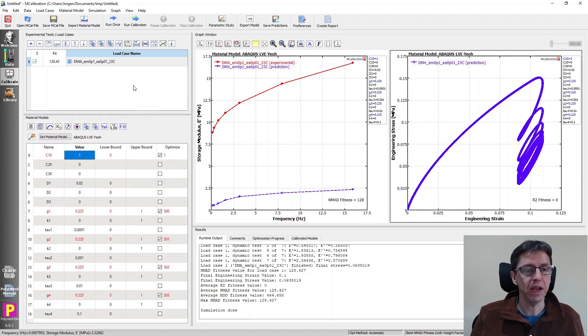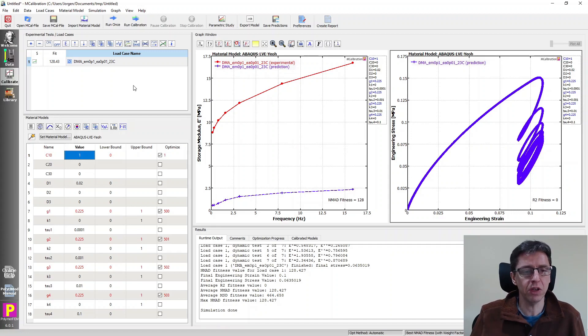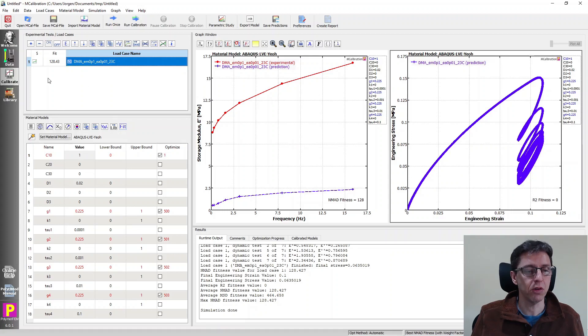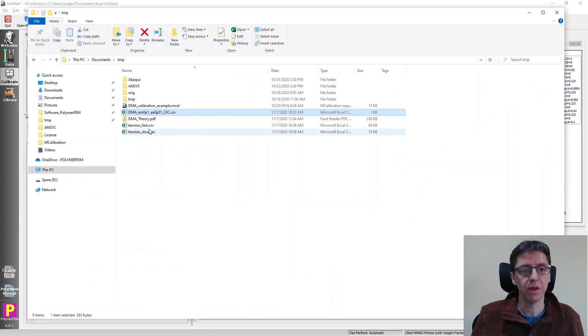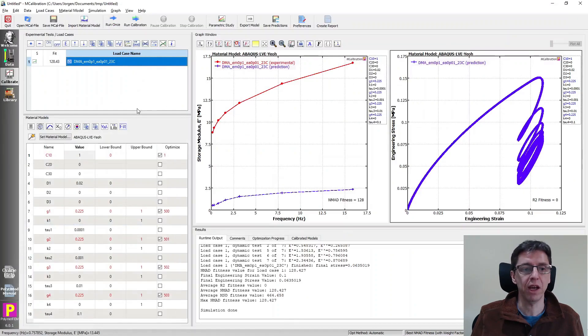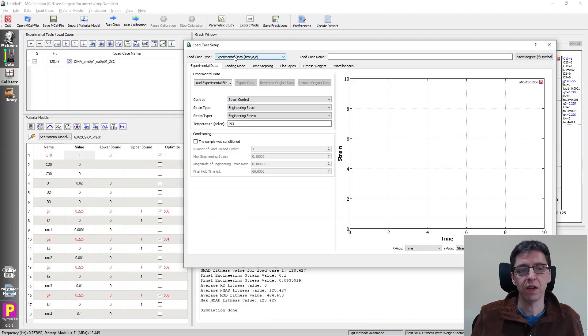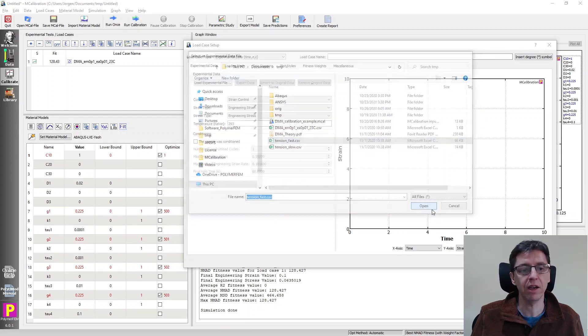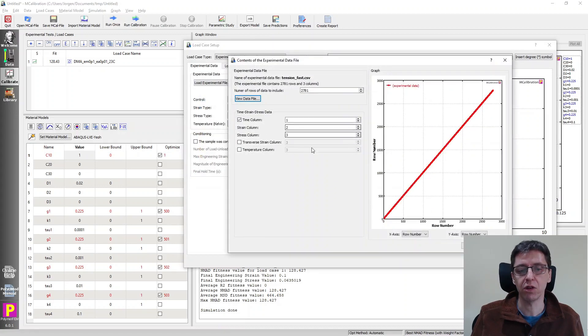Finally, the last comment I have is that the beauty of MCalibration, really the value that comes in here, is that you can combine this data set with many other experiments. So in my example here, I happen to have a tension test, both fast and slow. I can add this to my calibration. So I'll just click on plus, I have experimental data, load file, I'm going to say fast, and I'll add it. And I just read it in, stress strain as usual.